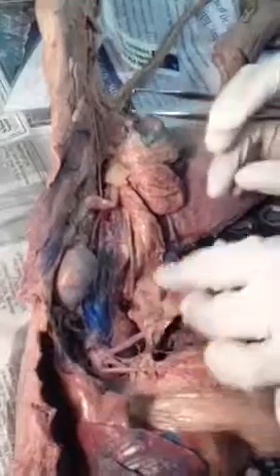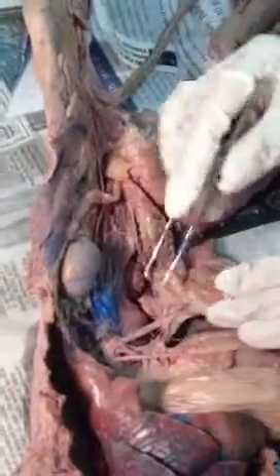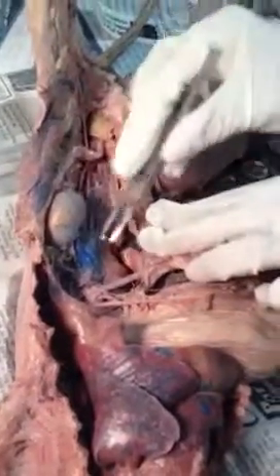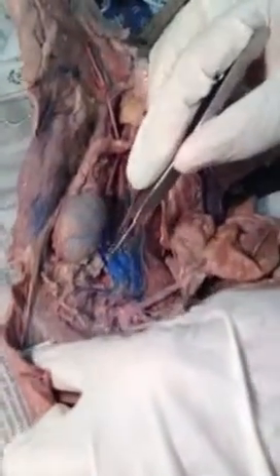Okay, and then that's your kidney, and so you can see the superior mesenteric, and if you can find the light, you'll see one going here, one going here.